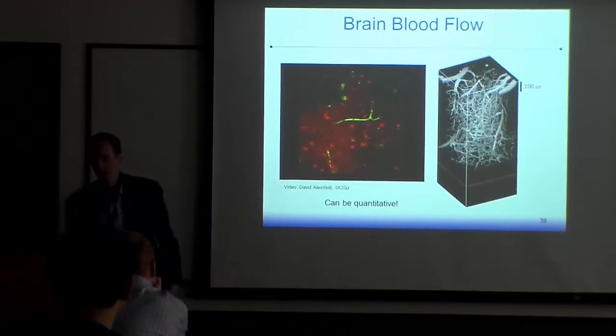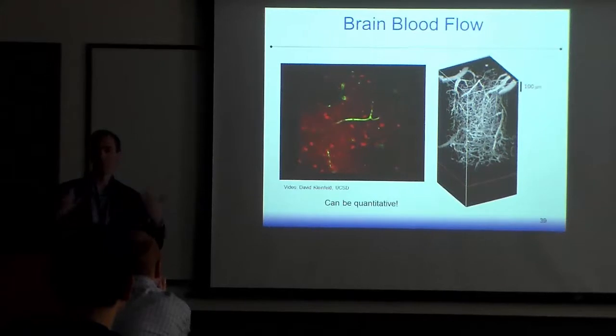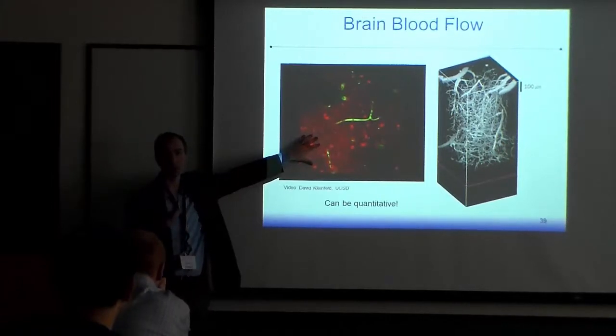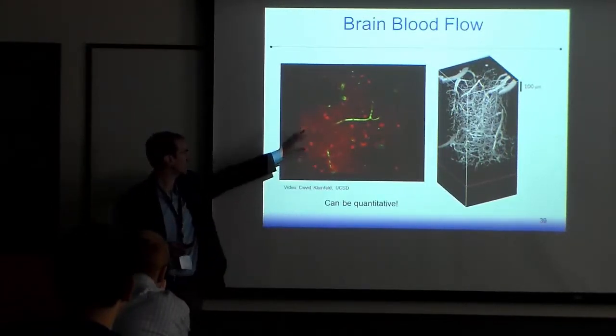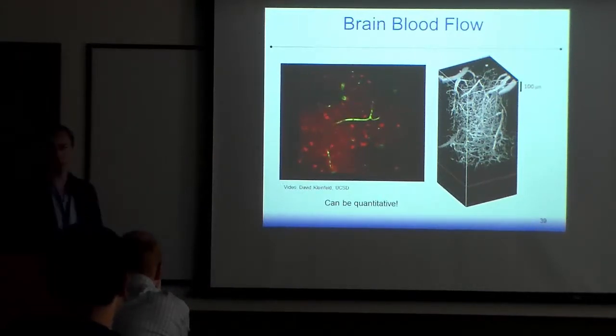And if there's time, I'll talk a little bit about that trade-off, about ways you can try to get more photons out, increase your signal-to-noise ratio, and go faster. So the more photons you get out, the slower you go, the better your image is going to look. And so this is a part of the trade-off. You can also reduce the field of view and whatever. But yeah, that was real time, and that was a couple frames per second.